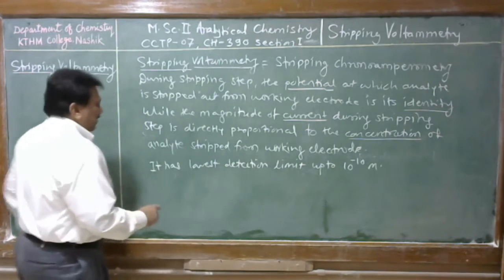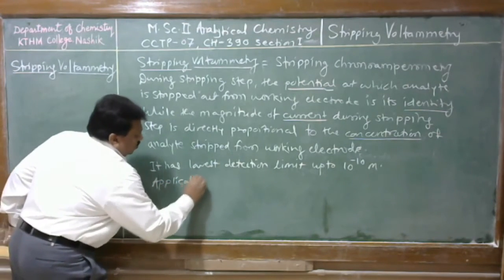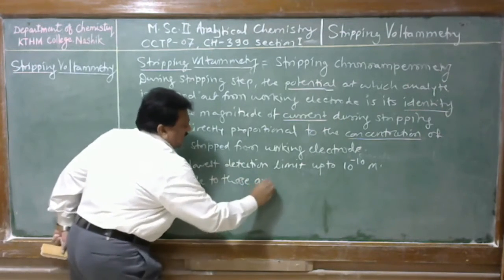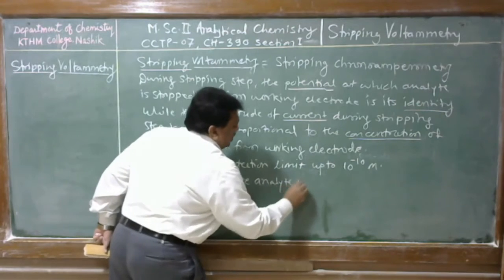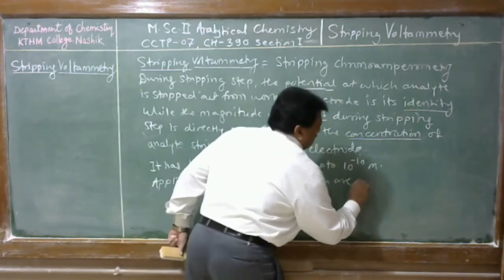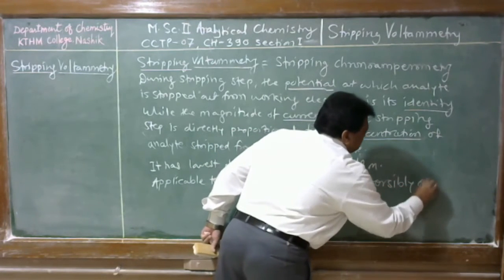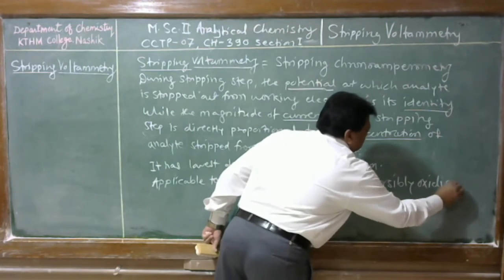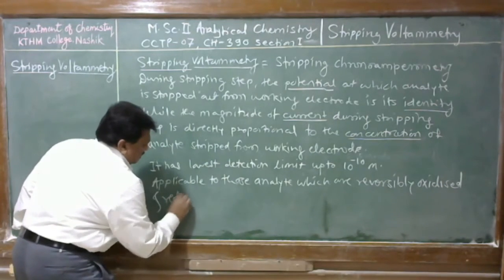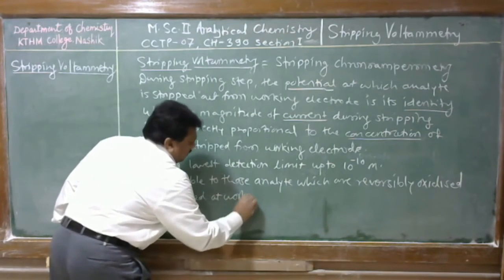This is applicable to those analytes which are reversibly oxidized and reduced at the working electrode.